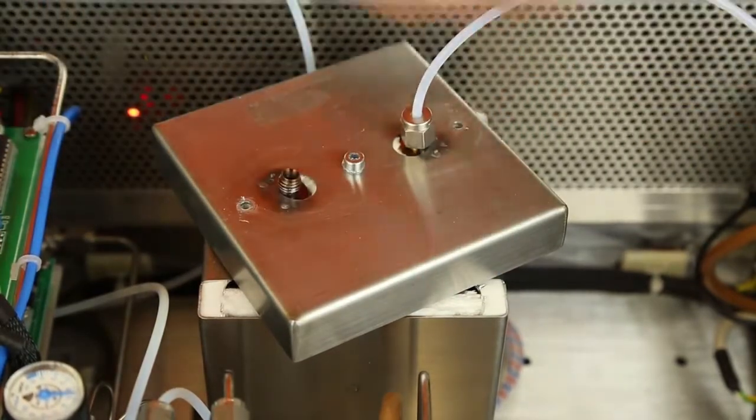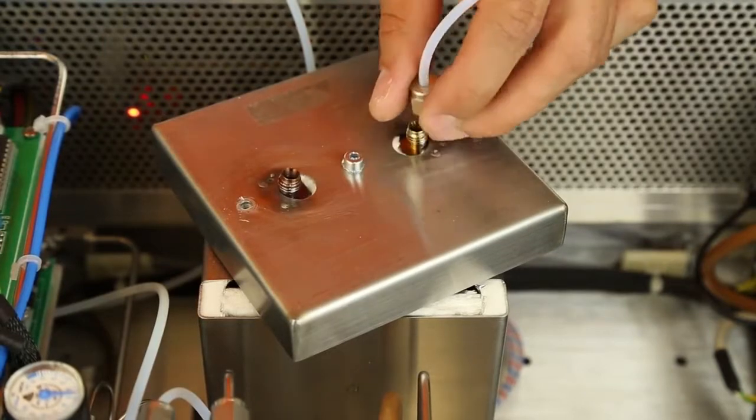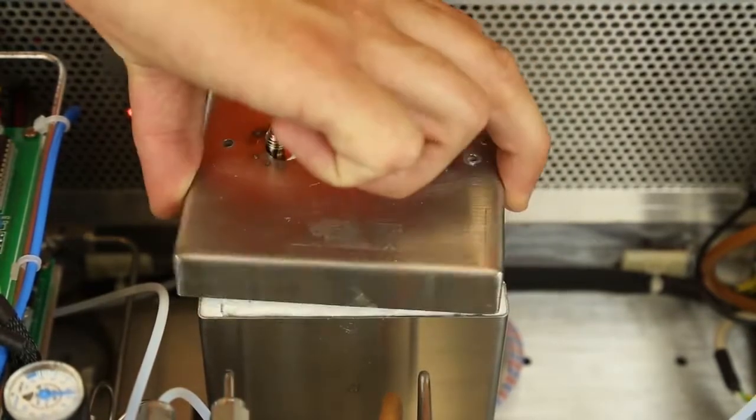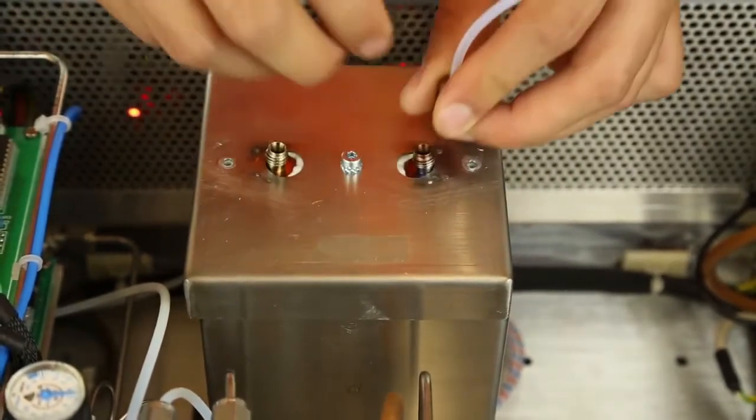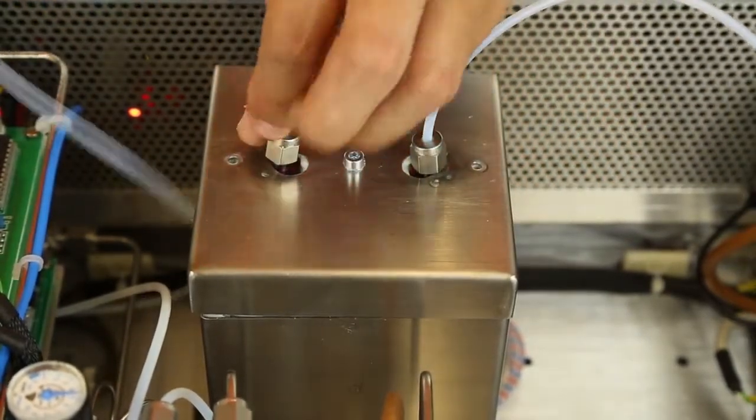Once this temperature has been reached, as quickly as possible, disconnect the gas input, reverse the column and connect the gas input to the former gas output. Reconnect the gas output and tighten the cover with the screws.